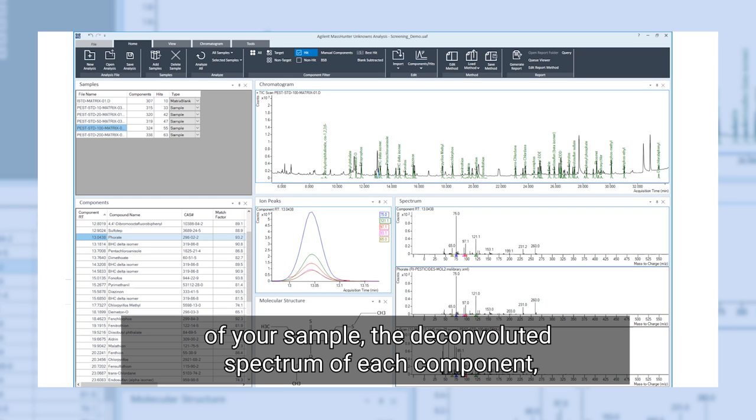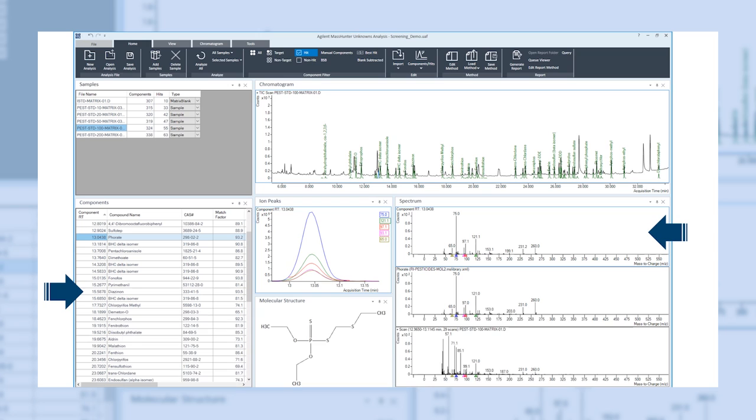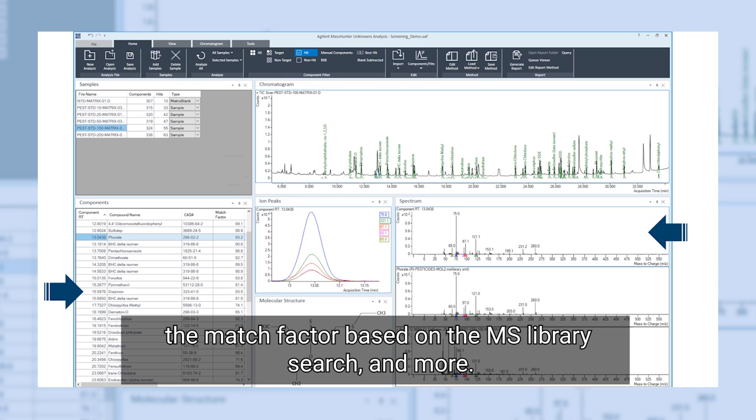Within just a few minutes, this will provide a list of components of your sample, the deconvoluted spectrum of each component, the match factor based on the MS library search, and more.